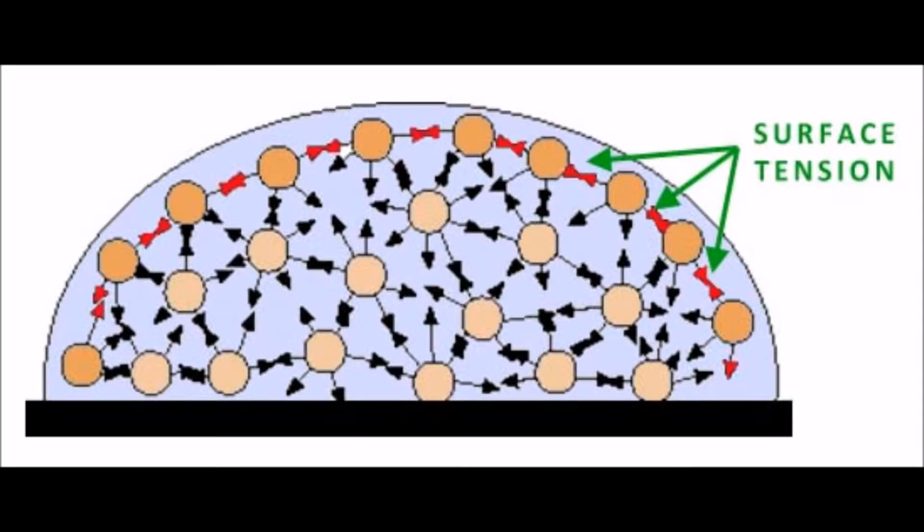The second test of surface tension and intermolecular forces had to do with looking at the effect surface tension had on a liquid based on the droplet shape it conceded when 5 drops of each liquid, isopropyl alcohol, water, and glycerol, were dropped onto a petri dish using a pipette. Once we performed this experiment using the same 3 unknown liquids from the previous test, we found these as our results. As you can see, liquid A has a very large surface area.